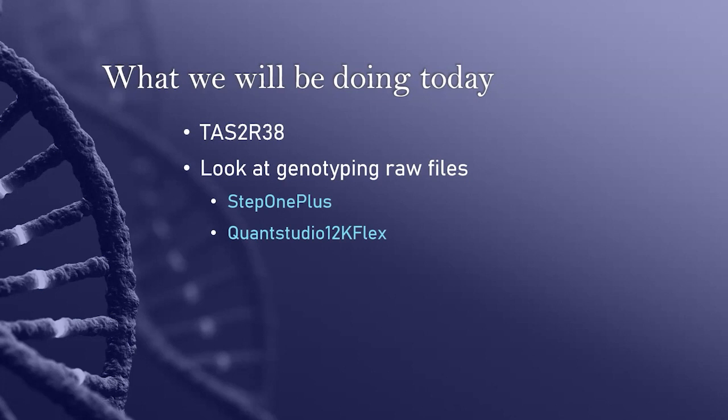As I mentioned, we'll be talking pretty extensively about TAS2R38 and its genotyping today. I'm going to give you some background information on the bitter taste receptor itself and why it's a primary focus point of the Read lab, and then after that, we'll be looking at the genotyping files that get spit out of the machines.